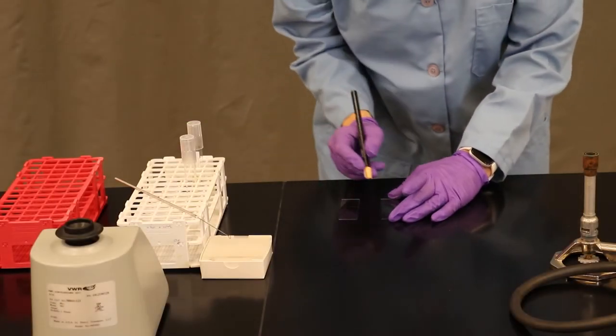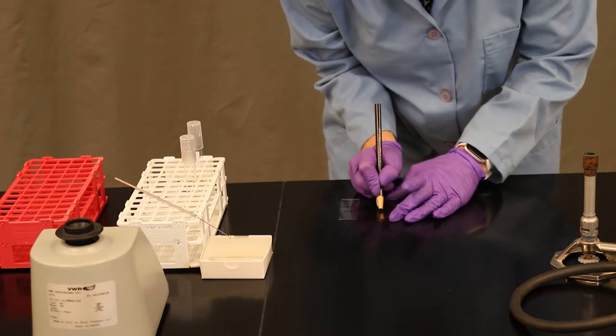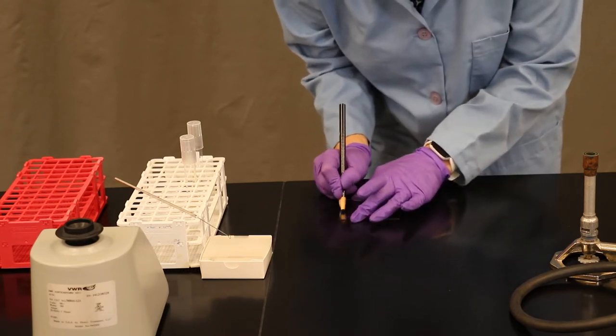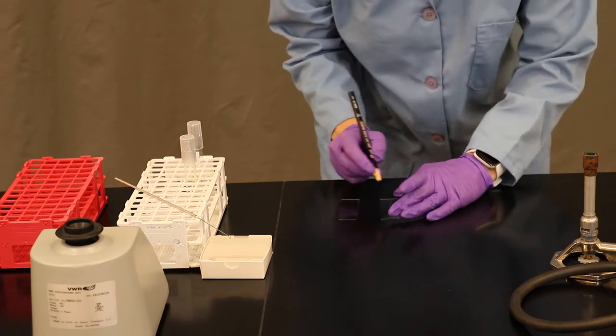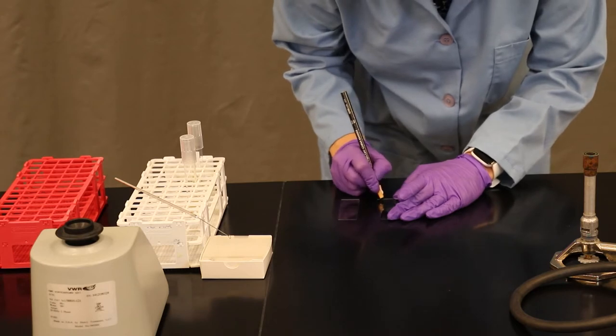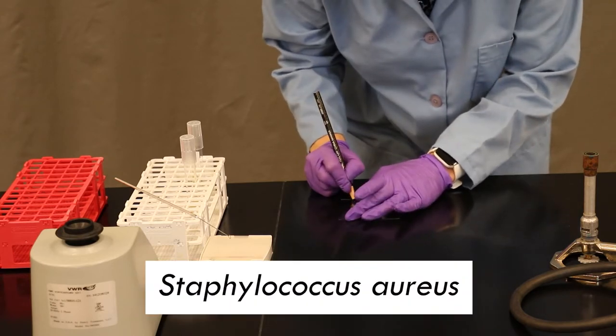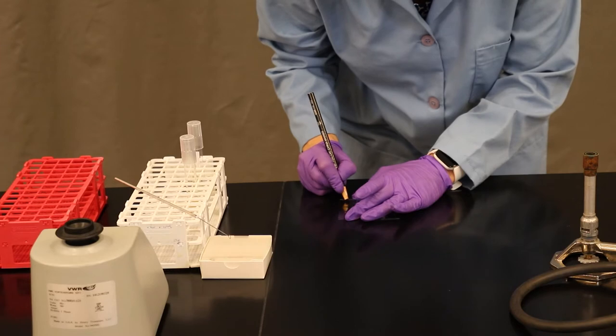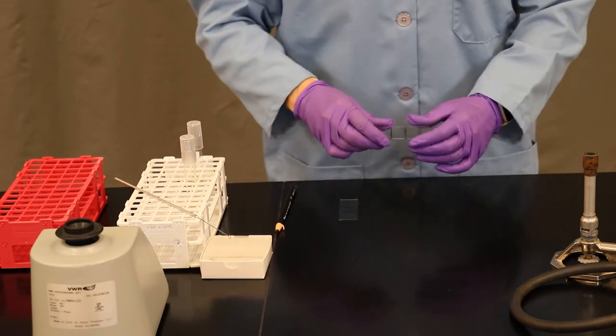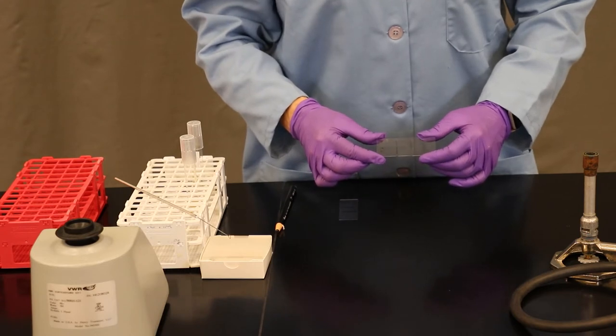Your glass slides have to be marked in terms of the boundary where you anticipate placing your bacterial culture. Either draw two lines or draw a wax circle. You also want to be sure to write the names of the organisms on the glass slide. Staphylococcus aureus, S.A. for short, and on the other slide, Escherichia coli. This is what your final labeled slide should look like.